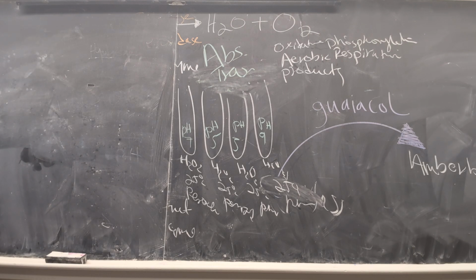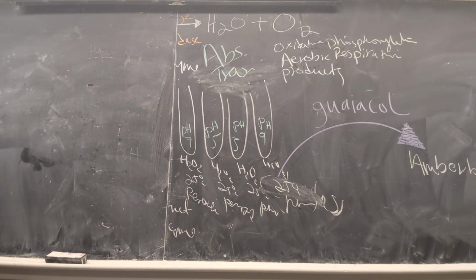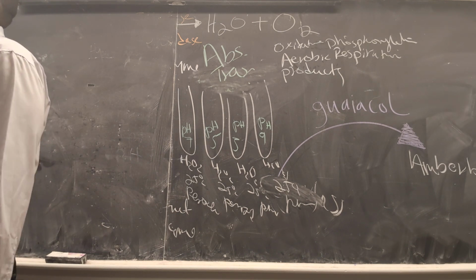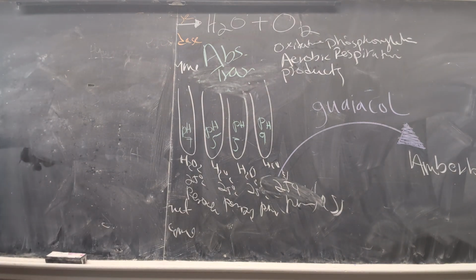Number one, we have a beam. What kind of beam? A beam of white light. Do you see the beam of white light? The beam of white light is going to strike a filter. Enough talking, just listen. You can discuss when you're doing the experiment.